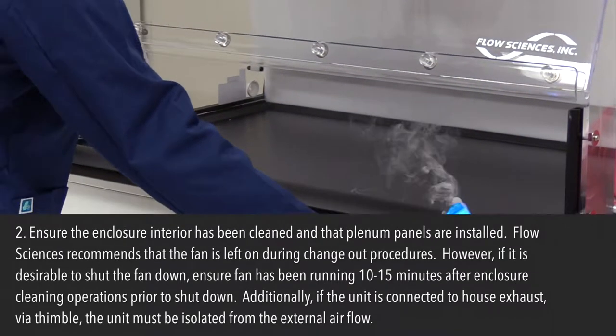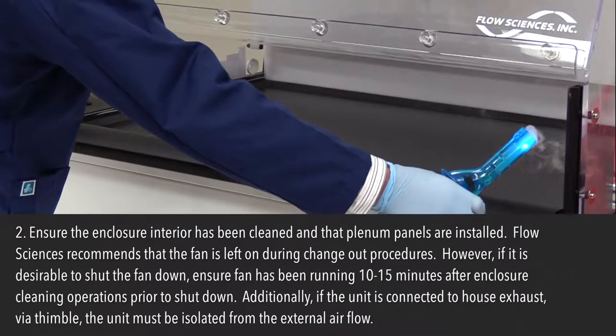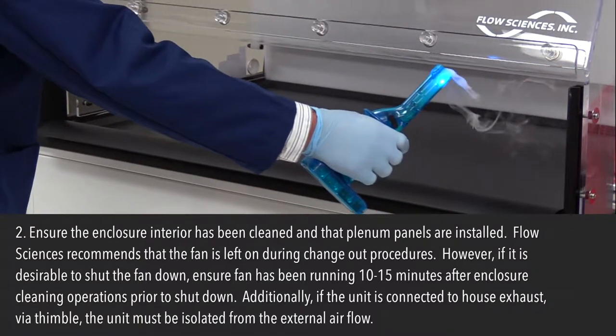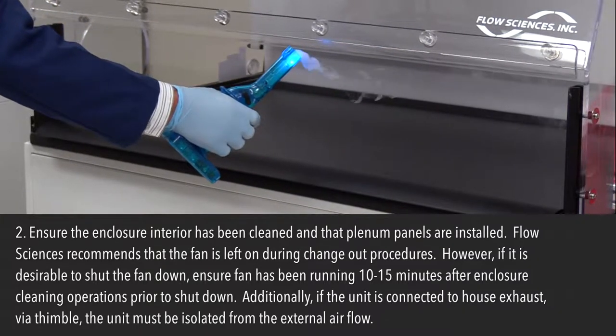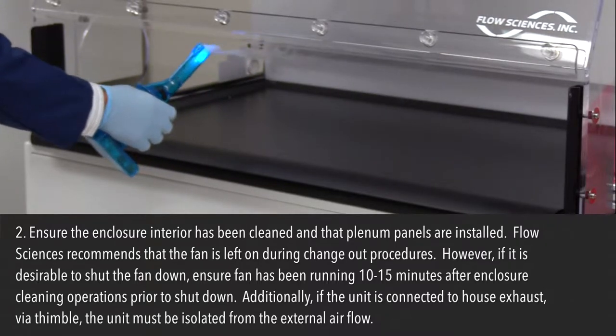Step 2: Ensure the enclosure interior has been cleaned and that the plenum panels are installed. Flow Sciences recommends that the fan is left on during change out procedures. However, if it is desirable to shut the fan down, ensure the fan has been running 10–15 minutes after enclosure cleaning operations prior to shutdown. Additionally, if the unit is connected to house exhaust via thimble, the unit must be isolated from the external airflow.